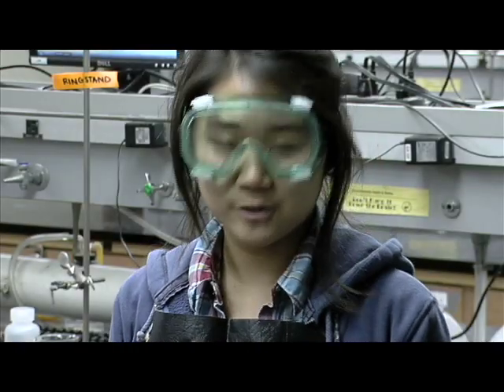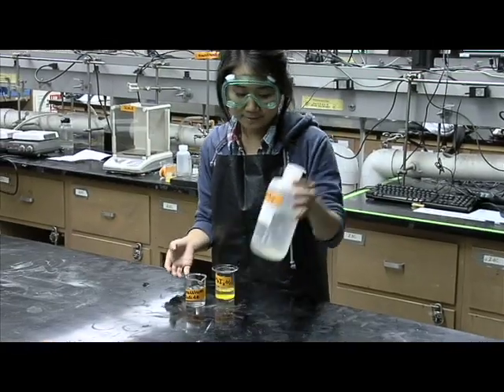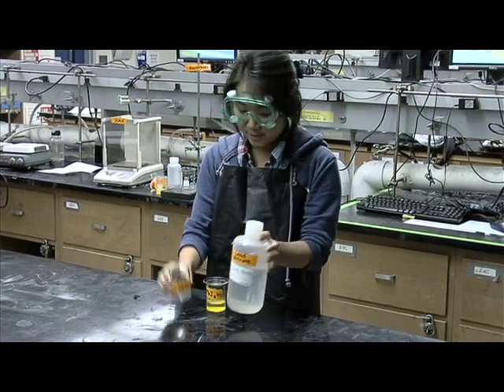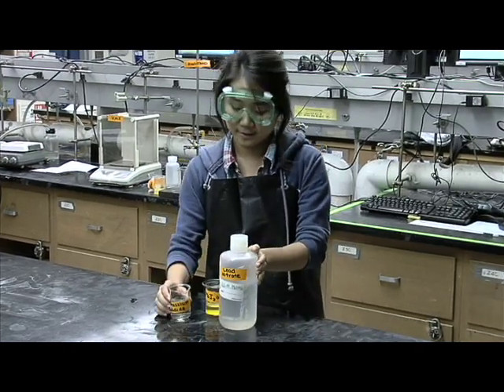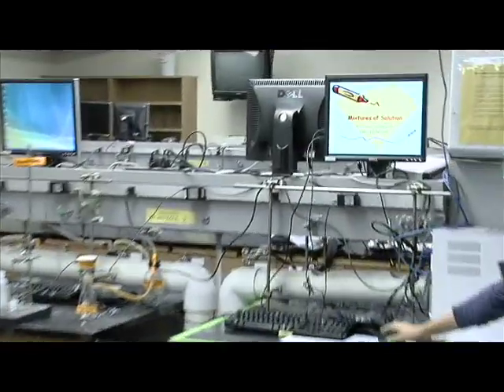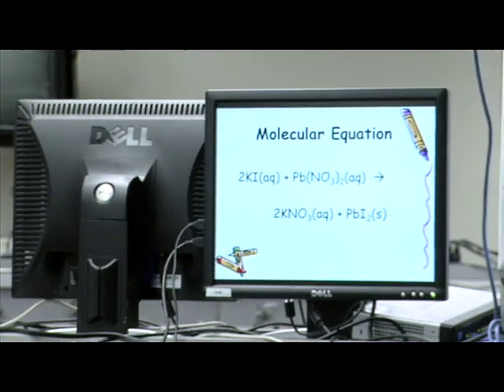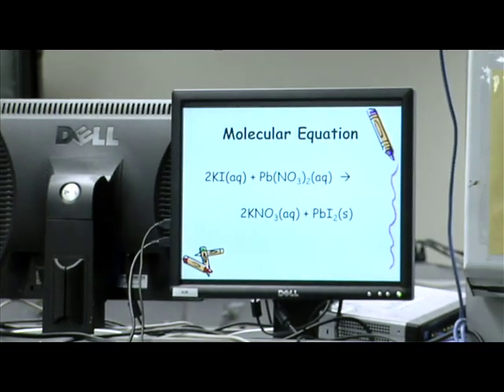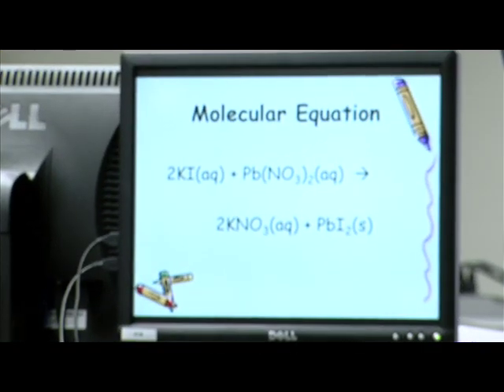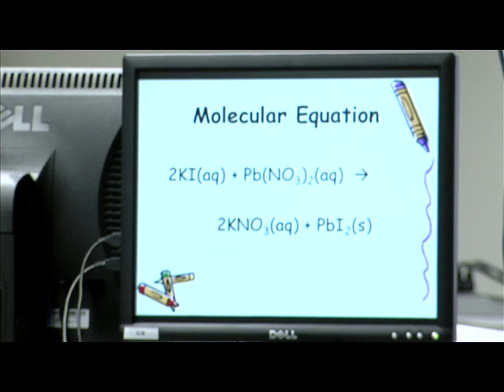Today we're going to demonstrate the filtration using a mixture of solution. We have lead nitrate with potassium iodide. Here is a molecular equation which shows potassium iodide plus lead nitrate, which will yield potassium nitrate with lead iodide.